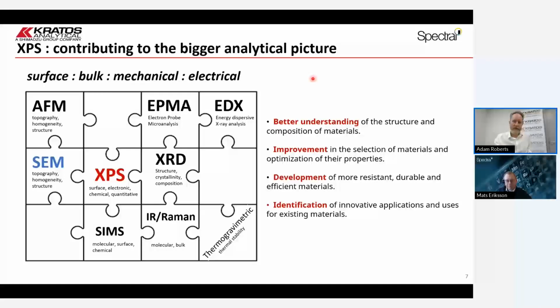So we appreciate that XPS, X-ray photoelectron spectroscopy, is part of the toolkit that the modern materials characterization scientist can use for their work. And we think that there is quite a bit of synergy between SEM, EDX and XPS. Over the course of the next half an hour, 35 minutes, we'll try and highlight both the strengths, but also the considerations of where one technique might excel over the other.